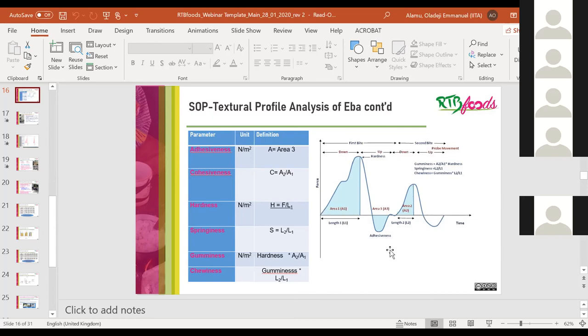Yes, we tried to do that. We tried to collect the spectra, but in work package 3, we are thinking that final products will not give us much spectral information, because the reference value we are going to use is from the raw root or from the intermediate. But it's a special product here because it has an intermediate, like pounded yam as well. The intermediate of pounded yam is boiled yam. In this particular work we are doing in RTBfoods, we looked at the intermediate of pounded yam, which is boiled yam, but we did not look at gari really as a product profile.